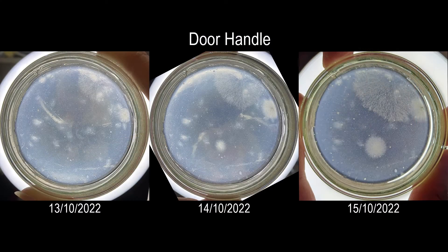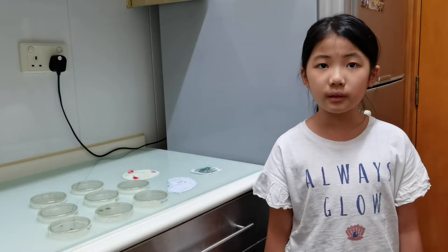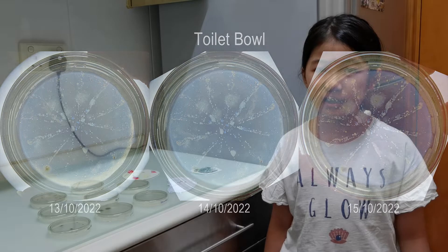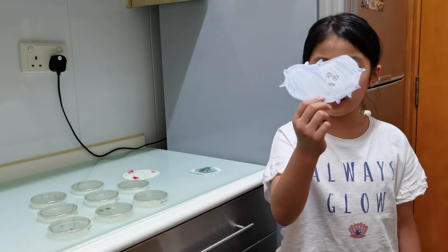For the door handle, it only had three huge fungal colonies. For the toilet bowl, it had just one colony of fungi, but close to 800 colonies of bacteria. And some of them may be the scary E. coli.